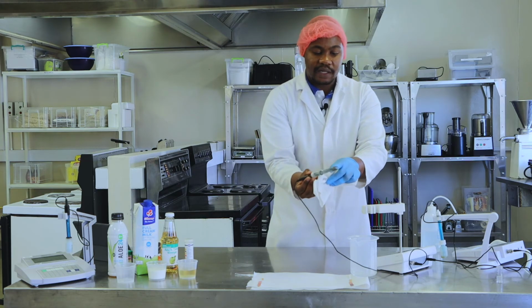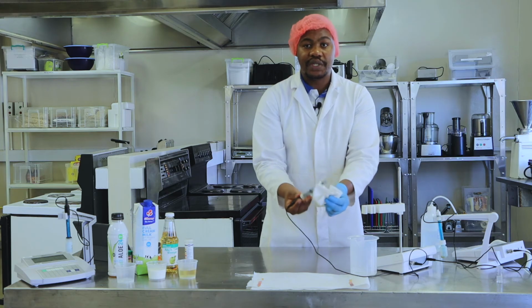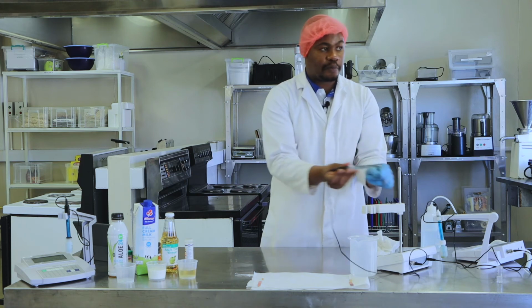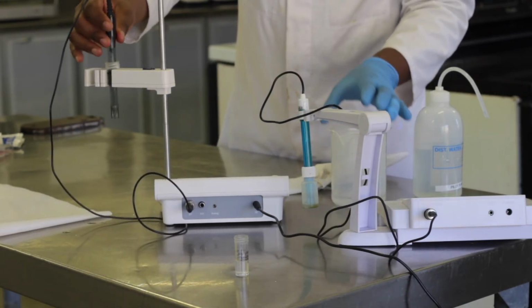The front part of the probe is the most sensitive part. Make sure that you do not break it, or if you are going to be using semi-liquid samples like mayonnaise, make sure that there is no build-up of product on the inside, okay? So that we can also take care of our equipment. So you can put it here.